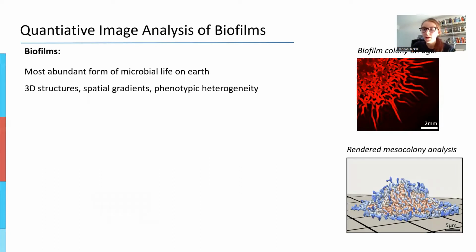So I want to start with a brief intro into biofilms in general to give you an idea of why we wanted and needed to develop the software. Biofilms can be described as a three-dimensional structure of cells embedded in an extracellular matrix, which can, for example, look very simple, like this pile of cells, basically, that you see in this image here.